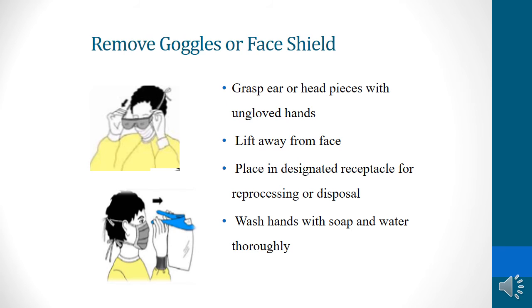Remove goggles or face shield. Grab the ear or head pieces with an ungloved hand and lift away from the face. Place in a designated receptacle for reprocessing or disposal. Wash your hands with soap and water thoroughly.